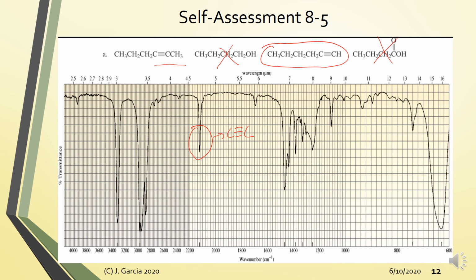So how to distinguish between the two? Terminal alkyne will show yung peak for a carbon-hydrogen bond wherein the carbon is sp hybridized, and ito yung peak na yun, no, higher than 3000. So this peak actually corresponds to a hydrogen attached to an sp hybridized carbon, no? So kung internal alkyne yan like this one, okay, wala ito dapat. Alright, so this is your terminal alkyne.